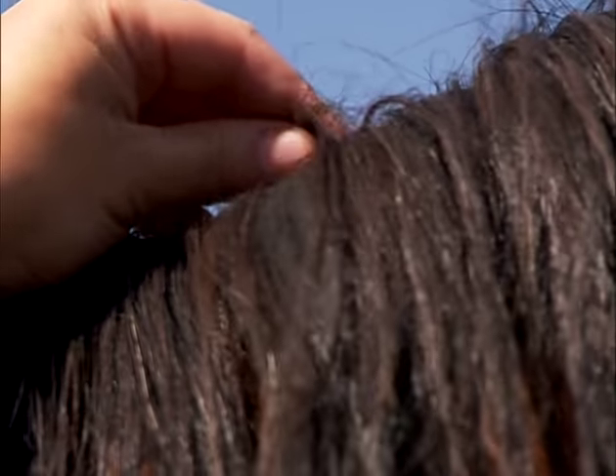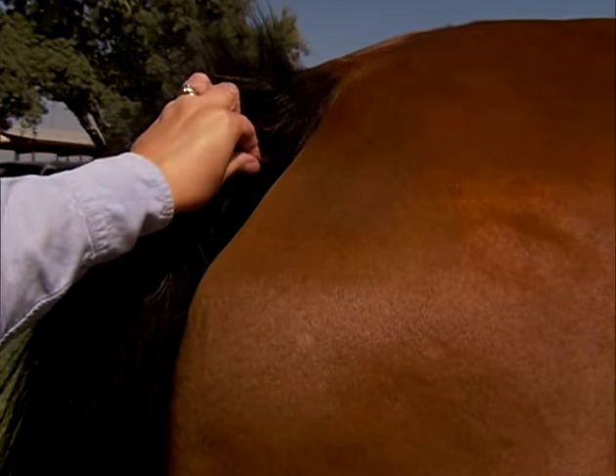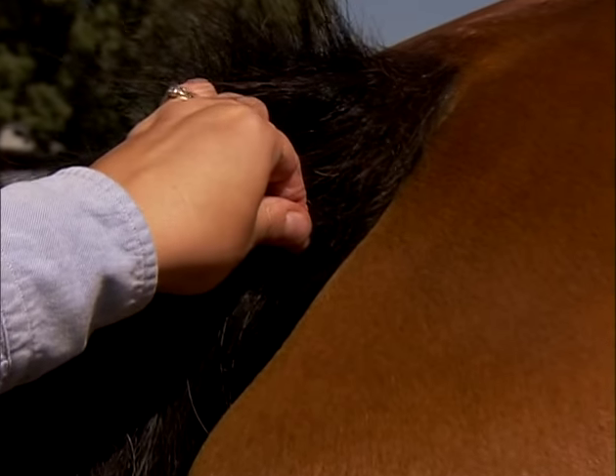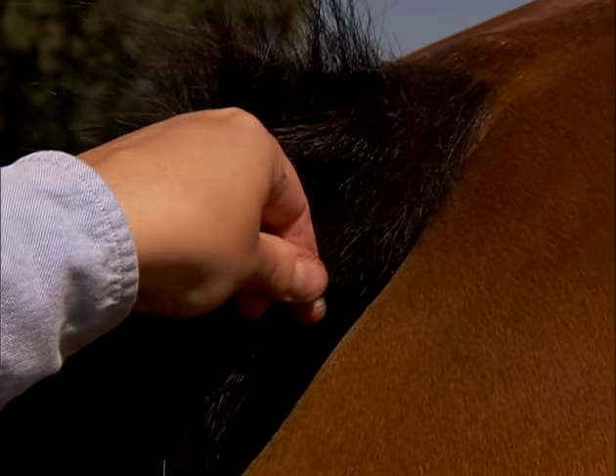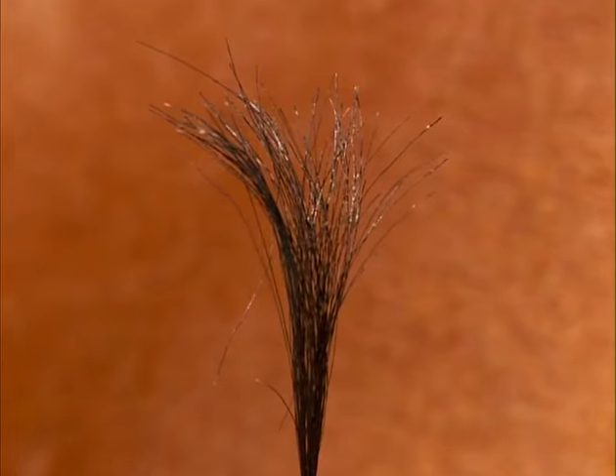We're asking for 30 to 50 hairs, so I do this a few times. You can choose different places on the mane. Another option, if you don't want to pull from the mane, is to pull from the tail. Just grasp a small amount at the base of the tail and pull, and you get a nice root sample.